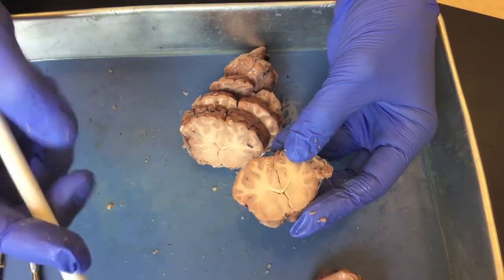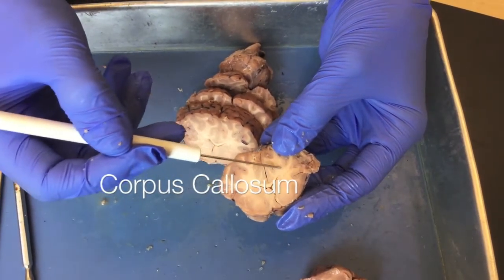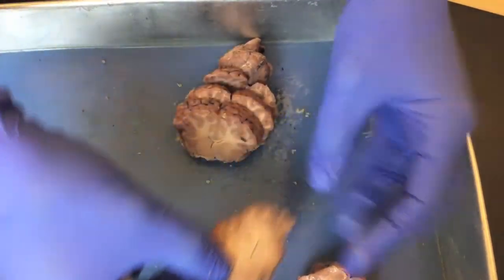You can see the beginning of the corpus callosum here in one of these most anterior sections and how it connects this side of the brain to this side through this large tract of white matter.